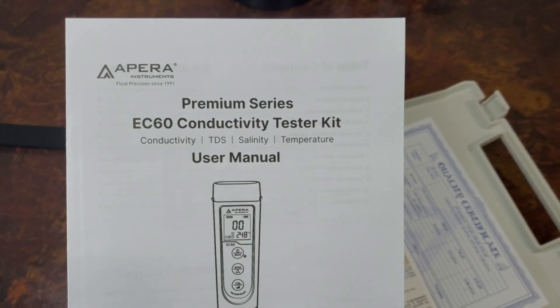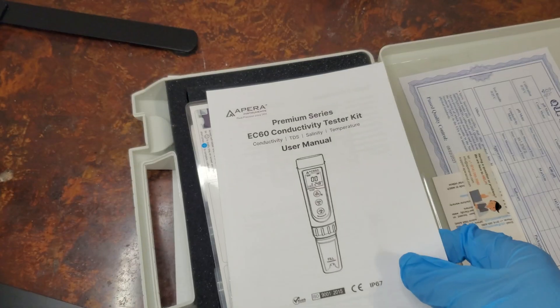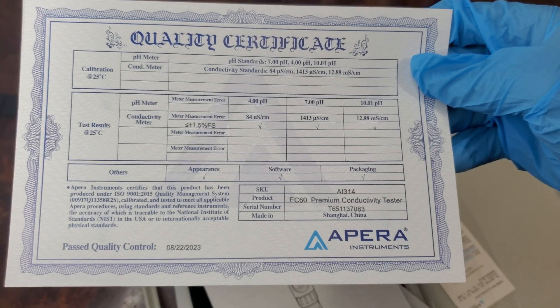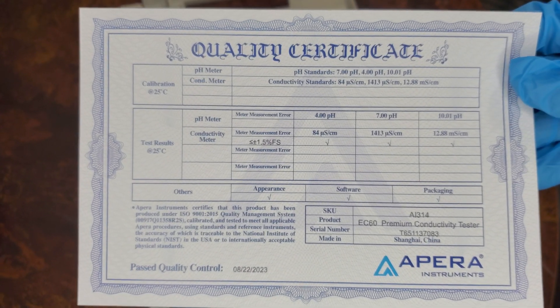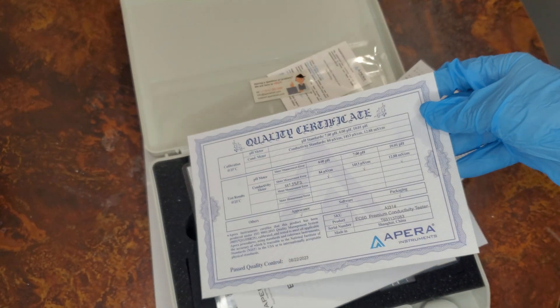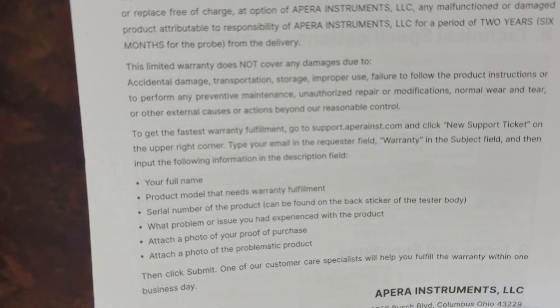The user manual can be handy for new growers. A quality inspection certificate ensures your device has passed the appropriate testing. There is a 2-year warranty and a 6-month limited warranty for the replaceable probe.